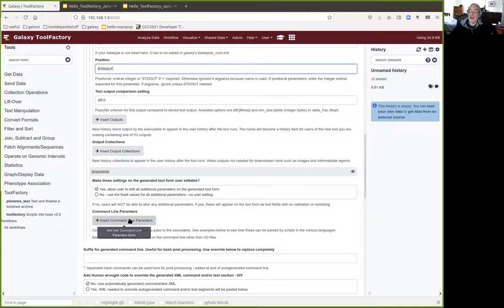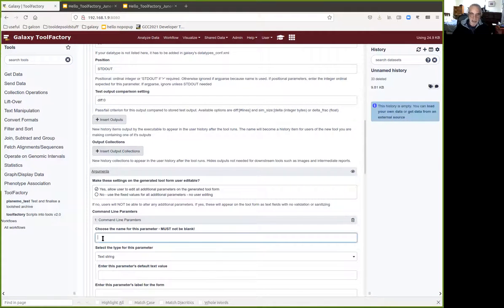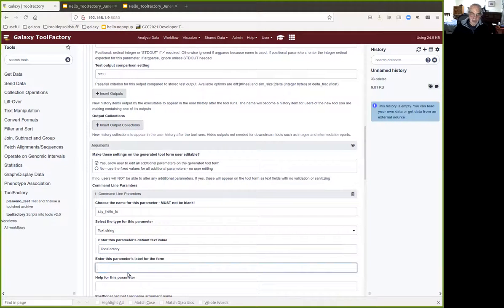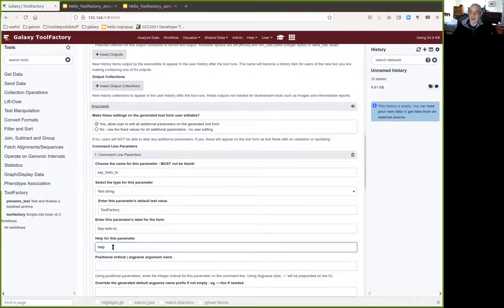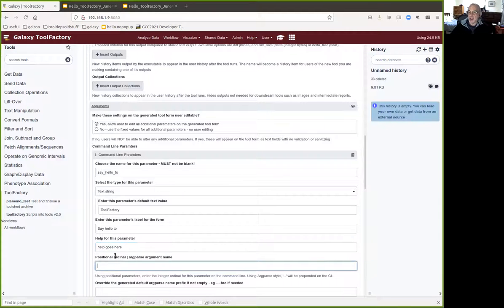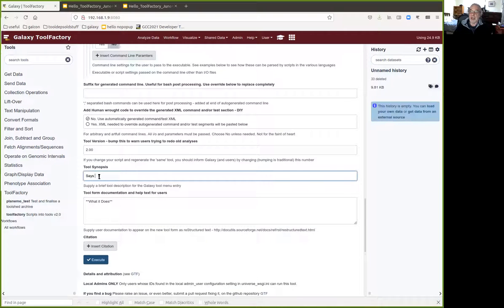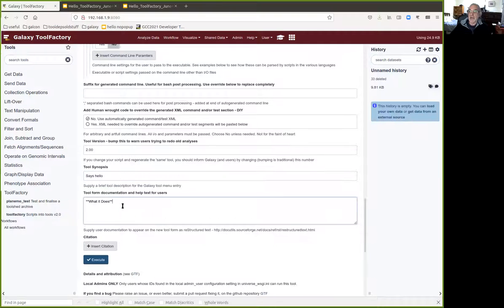We do need one command line parameter of the type the user can set, called hello_to, a text string with default value tool factory. The user will need a label on the form — say hello to — and help goes here if the user needs any. The positional is going to be position 1, because we want this to be $1 in the script. We'll give it a synopsis — this will appear beside the name in the tool menu — and we can put explanatory text in the what-it-does section. Then we press execute.